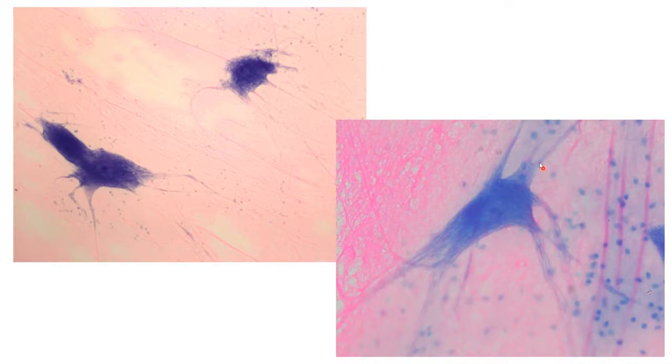Hey, if I zoom in really close, we were talking about an octopus before, right? Here's what I think really looks like an octopus right here. Got a little octopus eye. Check this out. This is the nucleus of a neuron. We can see it here in the lighter color. What would that dark spot in the middle of the nucleus be? Does anyone happen to remember?